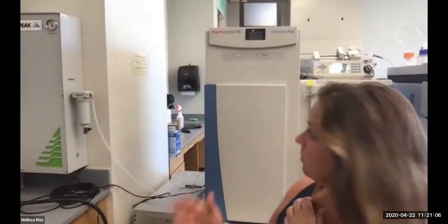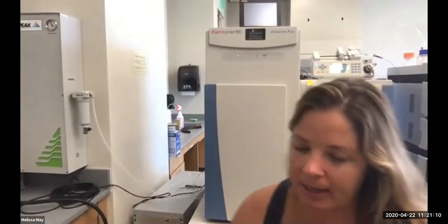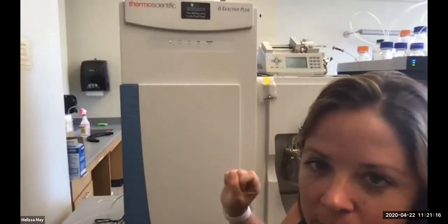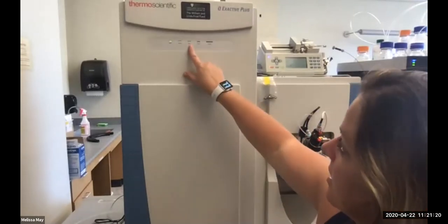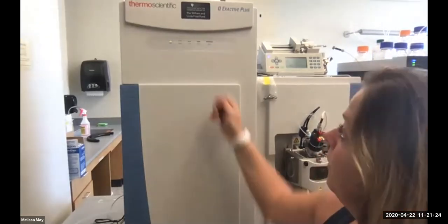So in terms of just general things about the MS, I'm going to try to roll this so that it doesn't get too messy. You can see right here, we have our status bar, and there's a series of different lights. You have a green light telling you that the power is on. This one tells you that the vacuum is on. This is the status of the instrument, meaning that it's ready to run. So basically you have the green light to go.